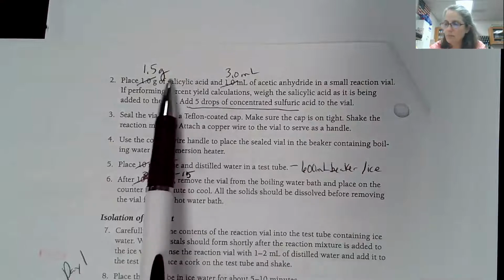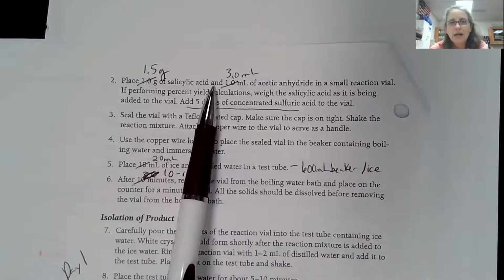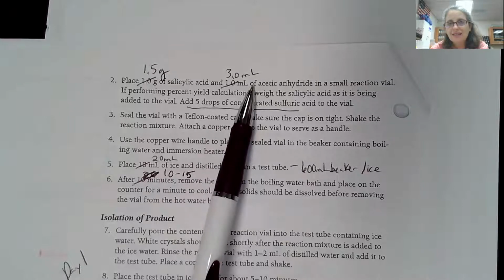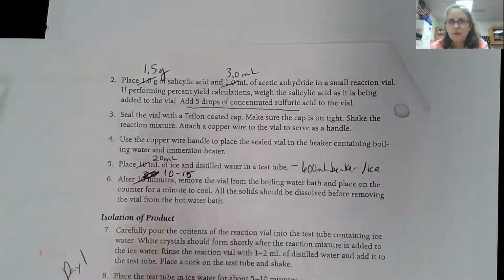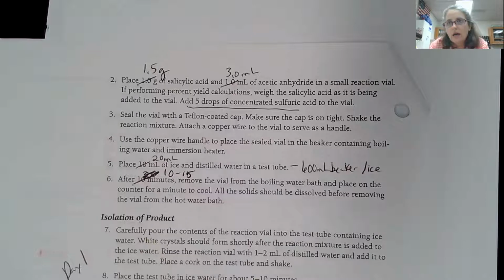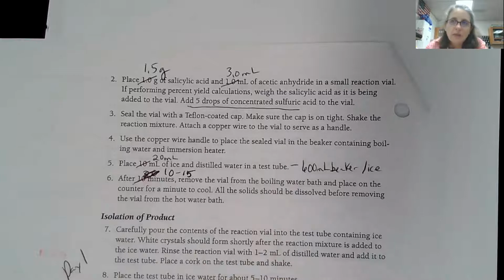So we are going to place about 1.5 grams of salicylic acid, which is a white powder, and about 3 mils of acetic anhydride into a glass vial. I'm using 1.5 in the amount just because over the years I have found that you get a better production if we put a little bit more into that vial. And then we're going to add 5 drops of concentrated sulfuric acid as a catalyst.